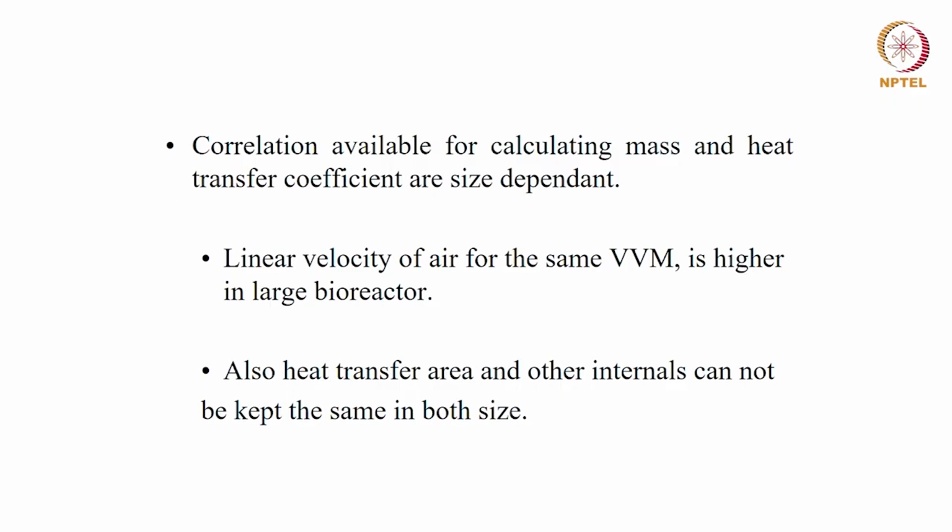Now, there are empirical correlations where the mass transfer and heat transfer coefficients are found to be size dependent. The linear velocity of air for the same VVM is higher in large bioreactors. Similarly, the heat transfer area and other internals cannot be kept the same at different scales.